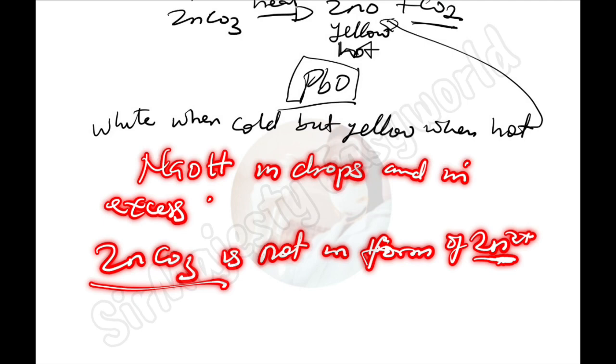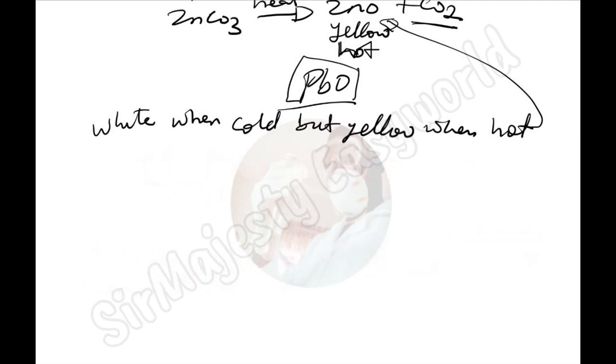Now, sodium hydroxide in drops and in excess to the sample will give you an observation of a white gelatinous precipitate formed in drops, which dissolves in excess. Your inference should be aluminium or zinc-2 ion present, since they said gelatinous. Don't say lead, because lead is not gelatinous.